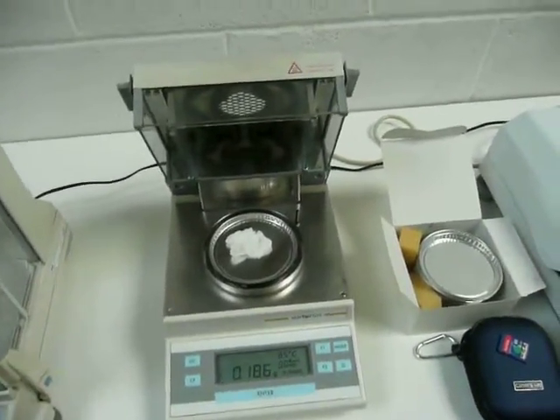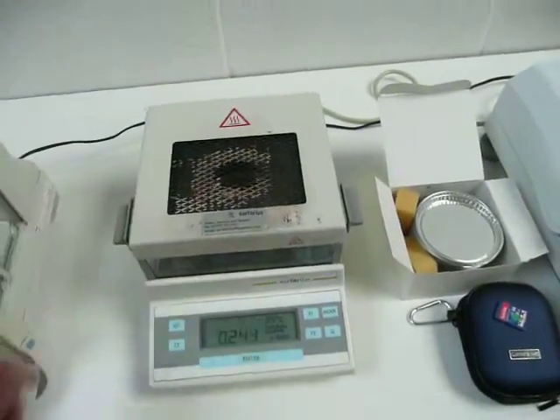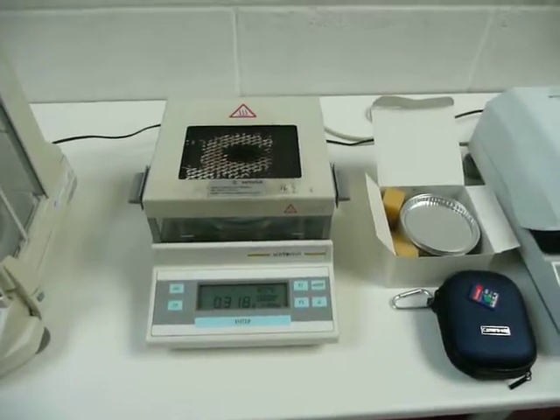We've got a Sartorius MPA30 — again a very good moisture balance.